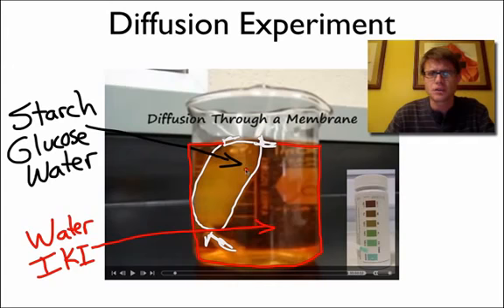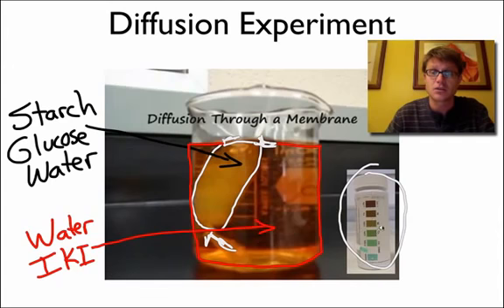The other thing you normally do before you start this is you start looking at the presence of glucose or the absence of glucose. And so you do that using these glucose test strips right over here. They're used to monitor glucose levels. So if you're a diabetic, it's a good way to see how much glucose there is in your urine. Because if you have high glucose levels, it's an indicator of problems with regulating blood sugar.